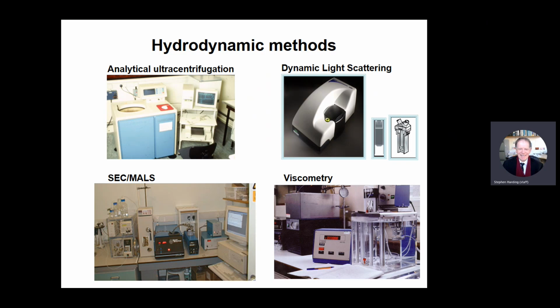So we just call it MALS because it goes by understanding that there is a laser involved. This is the MALS device, and it's coupled to SEC, size exclusion chromatography, which is enclosed in this temperature cabinet here. Now, if we take the lid off one of these light scattering photometers, we'll see this.